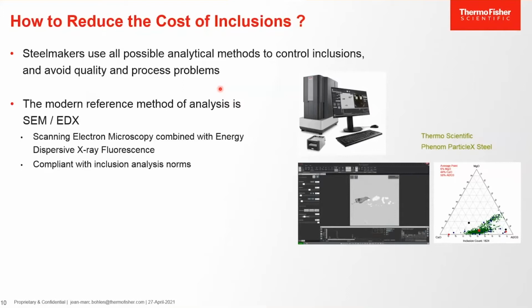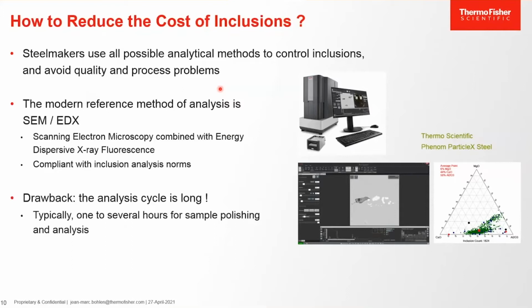This technique has the advantage of being quantitative and compliant with inclusion analysis norms. However, it has a main drawback. The analysis cycle is long. With SEM-EDX, it takes, in the best case, about 1 hour, but in many cases up to several hours for sample polishing and analysis. So this is too long if the steelmaker wants to rapidly control the inclusions.